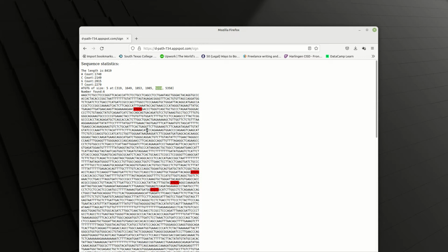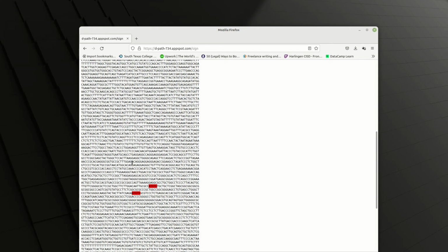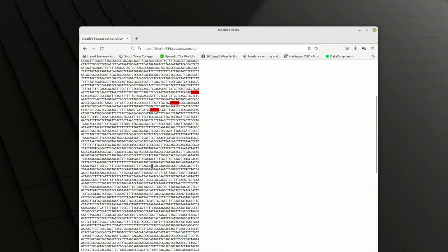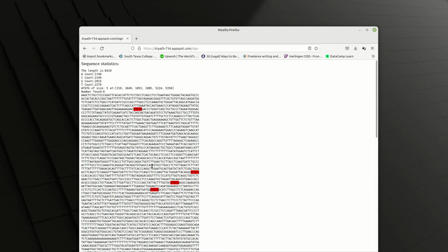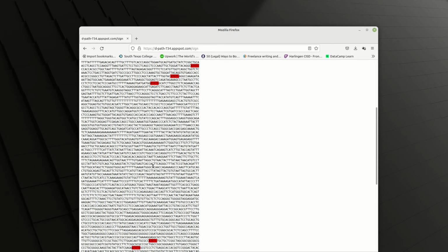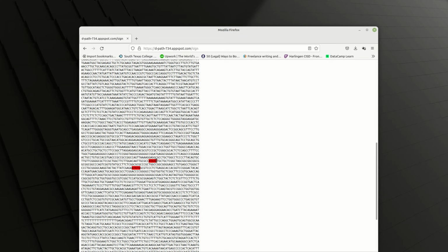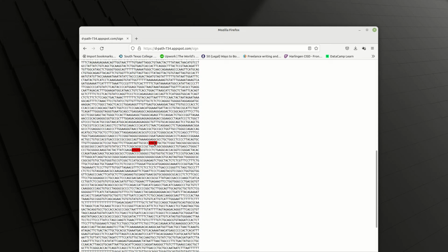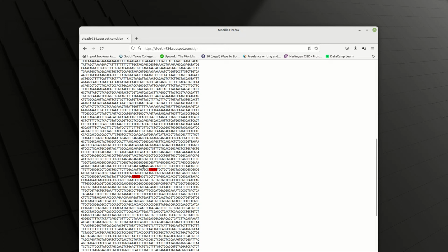So I'll just give that one away to everybody. That will be the answer. It has to be for this particular sequence. And I know how this thing works. I wrote it. So I know that has to be the correct answer. So this would be our start codon. I guess it could be a little further away, but very unlikely. It's the closest one, of course. So I'm pretty sure it's here.